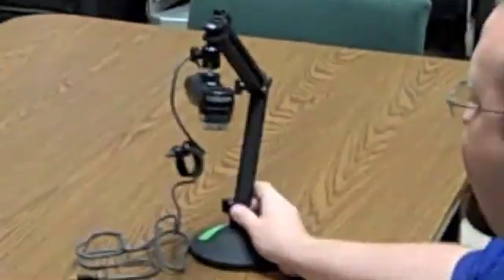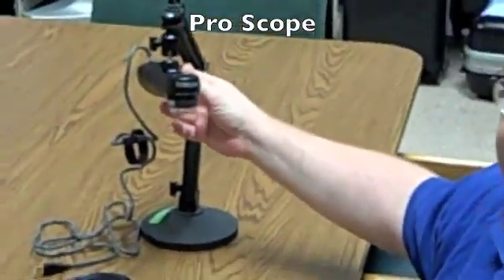And what's the big one in the back? And back here, we have a ProScope, which is basically a digital microscope.